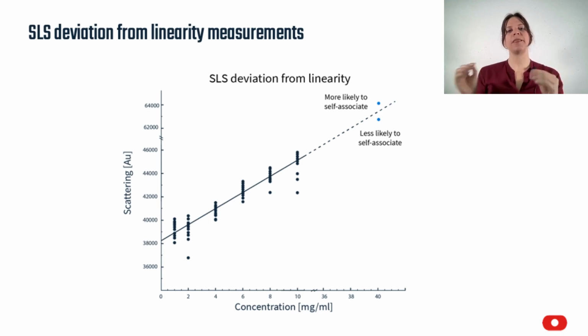Finally, they prepare one last sample at a higher concentration of 40 mg per ml. They found that this is an ideal concentration for this type of experiment, as it's past the point where the linearity of those low concentration samples break down, but it's not so high that it's difficult and resource intensive to make a small aliquot at this concentration for measurement.